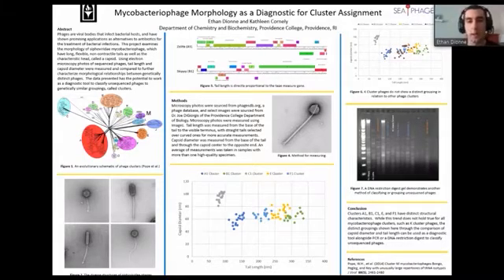This comes with one challenge, though, because not all of the phage clusters form these nice groupings on a graph. If you move your eyes to figure 6, I tested the K cluster phages, which Colby and Olivia talked about in their presentation. We were interested in K cluster phages because they have a very broad host range. They're known to infect those notoriously antibiotic resistant tuberculosis and abscessus bacteria.